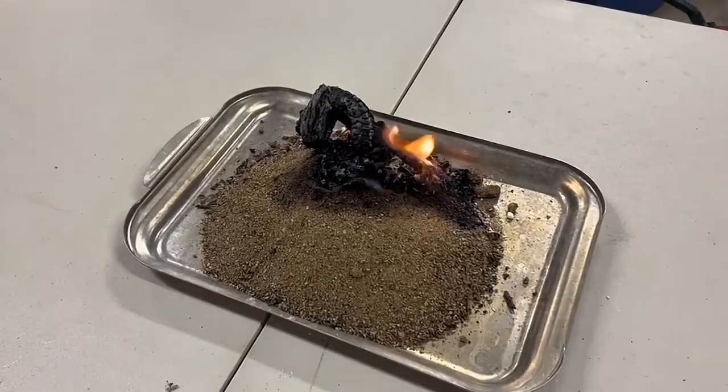This is where I'm gonna end it. Pretty good results. So to recap what happened, the first attempt was not good. I did not give enough time, and the carbon snake did not have enough time to form. But the second time, when I gave it time, it formed pretty good. Not as long as I wanted, but it still worked.